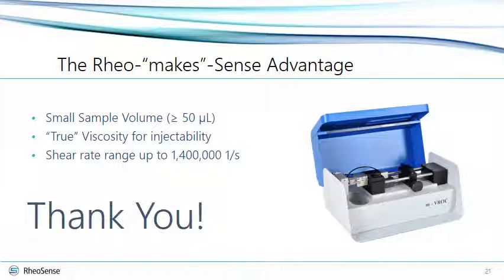You will need a 100 microliter to 500 microliter syringe with the corresponding jacket and a chip capable of measuring the sample under low shear conditions. Assuming the viscosity of your sample is pretty low, from 1 to 100 centipoise, an AO5 type of chip with a 50 micron channel depth is typically ideal.